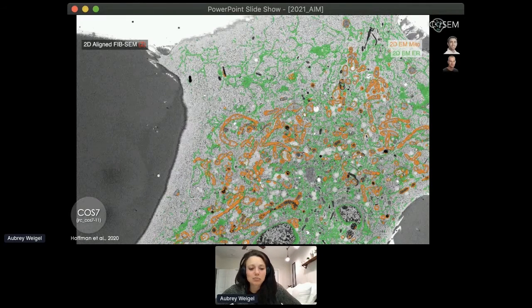And then as a byproduct, the ER channels are aligned. So the ER segmentation shown in green and the light data shown in, I think it was in blue or purple, sorry. So I should mention here that all of this is sort of the best case scenario.